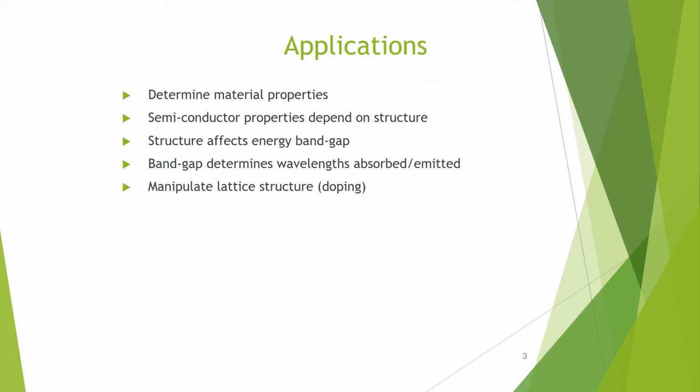Here we are going to discuss some applications of X-ray diffraction techniques, or XRD, which can be useful in determining material properties. It is also used for semiconductor properties that depend on structure.